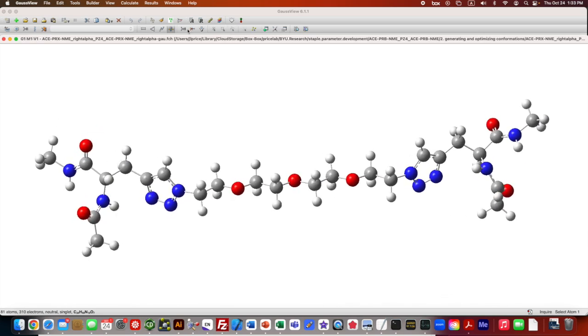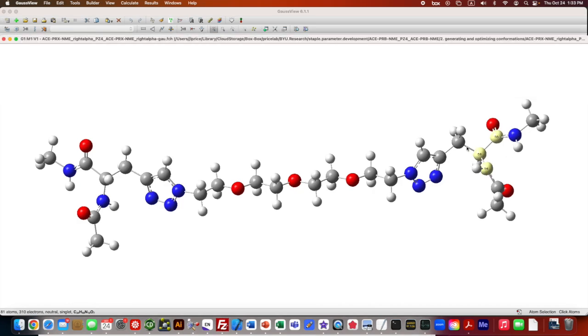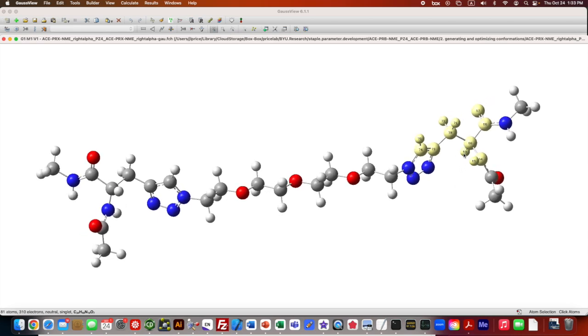The way I've divided it up, all of those atoms in yellow are the propargyl glycine residue. I have a different three-letter code for propargyl glycine on its own. For propargyl glycine in this kind of staple with the triazole, I gave it the three-letter code PRB. No reason other than that's what I chose. All of that's in the supporting information of my paper. I've got some figures that you can look at and refer to in the future.